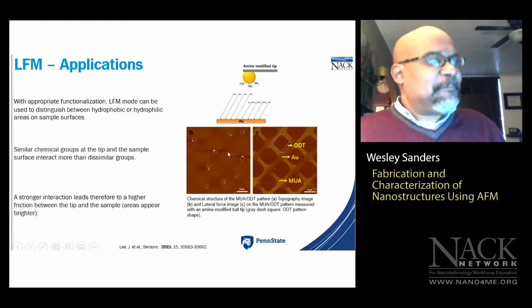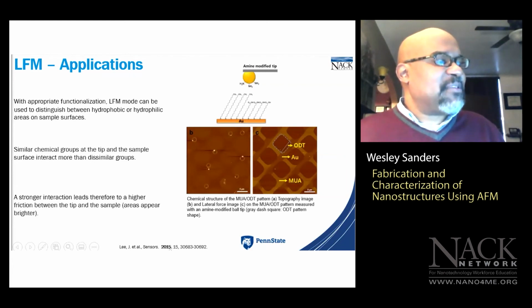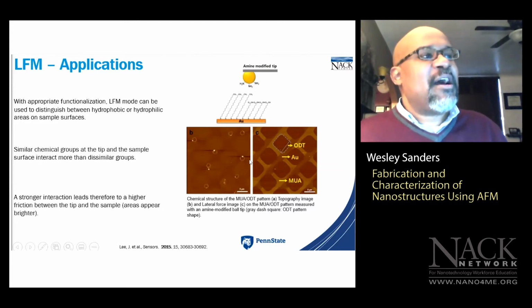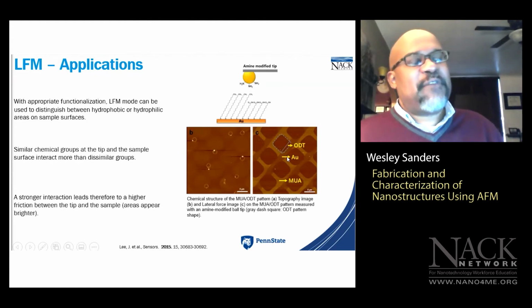So here's an image I really like. This is some research that was published in 2015 in a copy of Sensors. I really like what the researchers did here, because as a chemist, I can really appreciate what's being shown. So these researchers patterned an octadecane thiol and a mercapto undecanoic acid monolayer on the surface of gold.